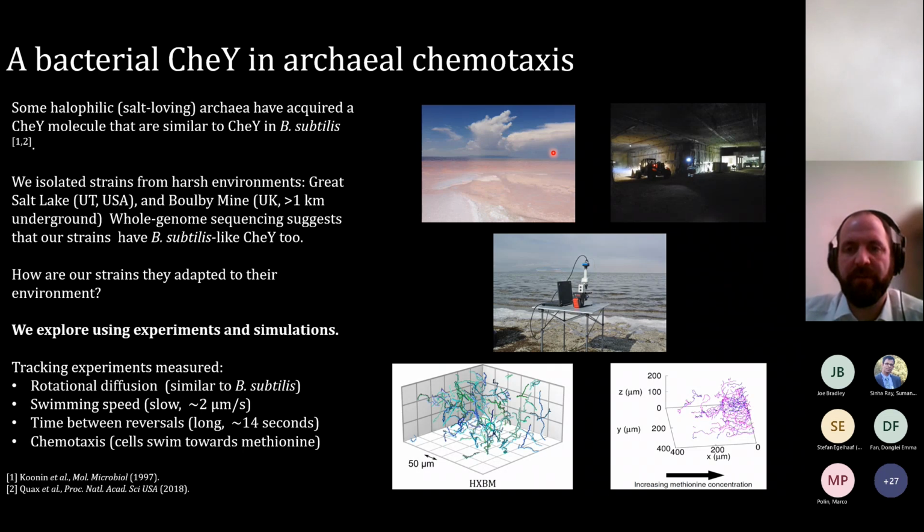So in collaboration with Bonnie Baxter and Jamie Butler from the Great Salt Lake Institute, we isolated some archaea from here. We also isolated some archaea living on the picture on the right hand side. This is a dark matter lab. It's the deepest working lab in Europe, deepest working mine, sorry, in Europe, and it happens to have a lab in it. So we can go down and capture and isolate these interesting organisms that creep out of the walls. And again, this picture in the middle shows you our Home Depot constructed microscope.